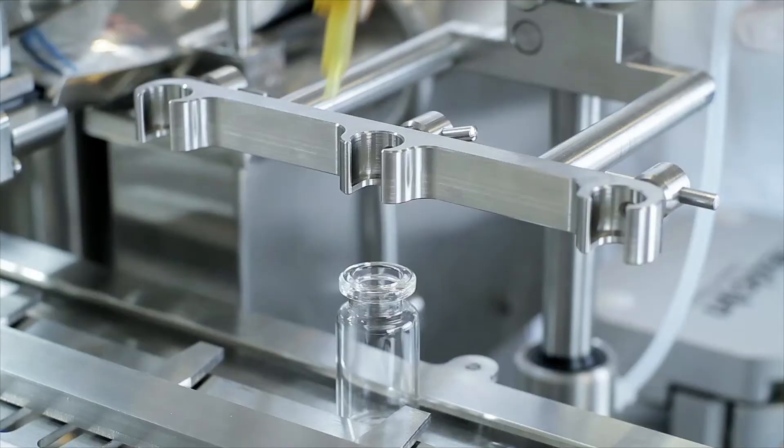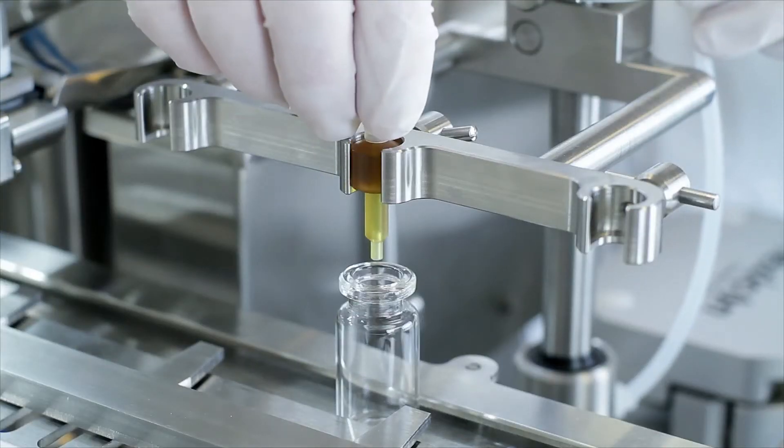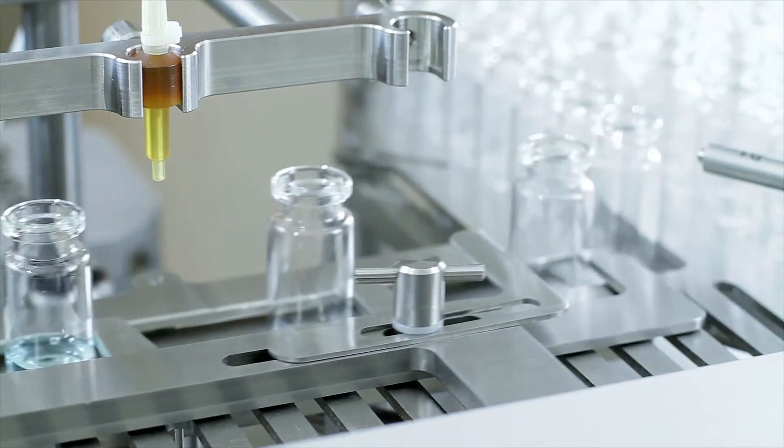Aseptic SU works with most types of Flexicon peristaltic filler to ensure accurate dispensing, avoiding costly overfilling.